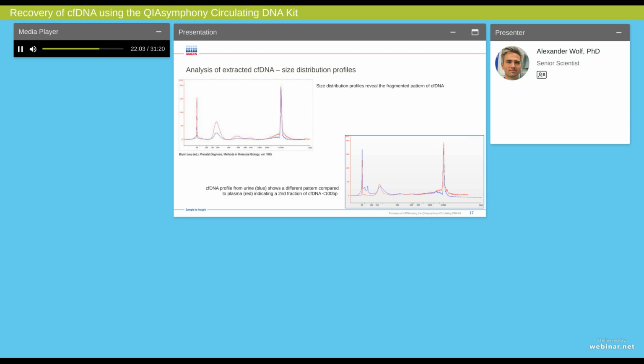Moreover, at the level of the larger marker peak, around 10,000 base pairs, larger DNA fragments are visible, which may be traced back to larger cfDNA molecules, published for example for inflammatory diseases or cancer. But this broader peak may also represent genomic DNA from leukocytes, which then would rather reflect a reduced plasma quality.